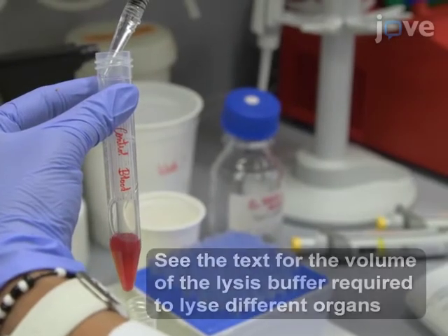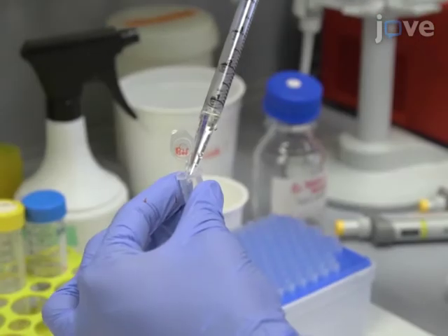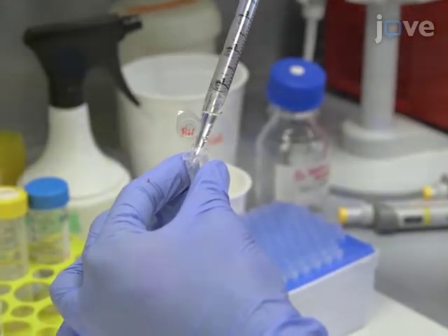Use single-strength ammonium chloride potassium buffer to lyse blood, bone marrow, spleen, and liver cells. Filtering of cells derived from organs isolated from mice to get single-cell suspension before going on to the flow cytometer is important to prevent it from clogging.